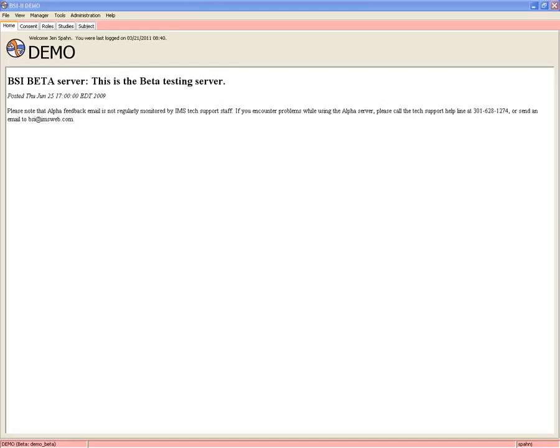So this module allows you to create fields for consent forms, enter patient consent data, and then get warnings when you requisition that patient's or that subject's specimens in requisitions if there is a consent issue.